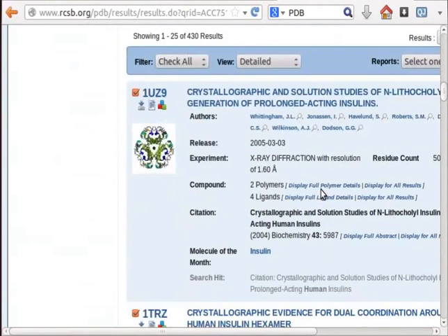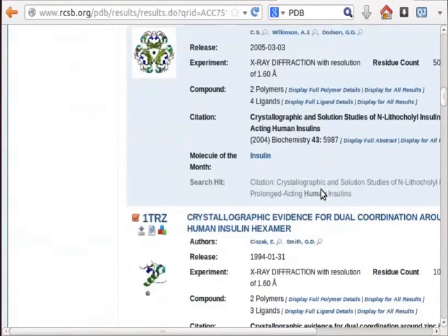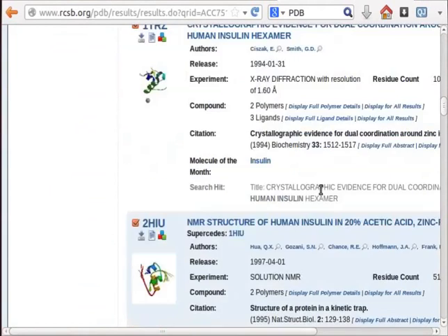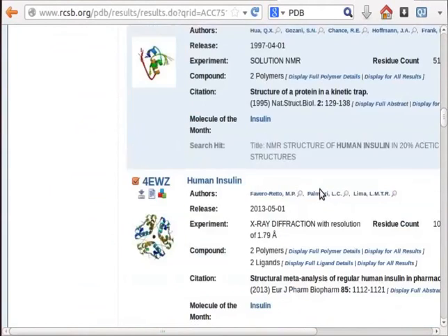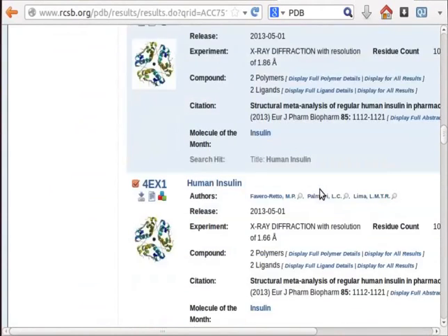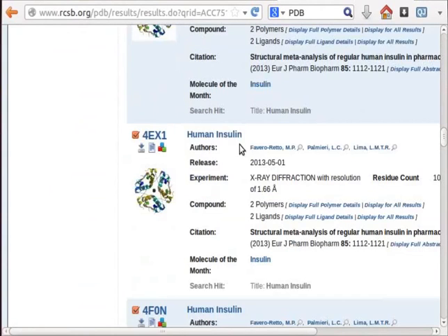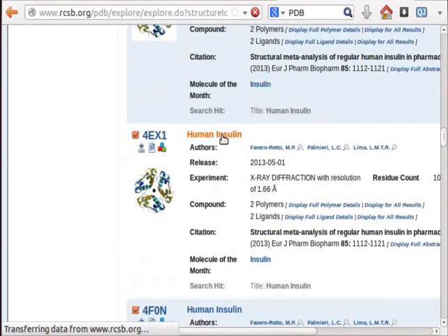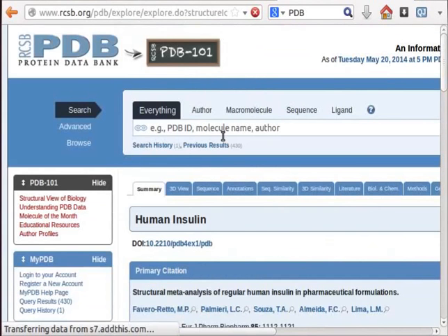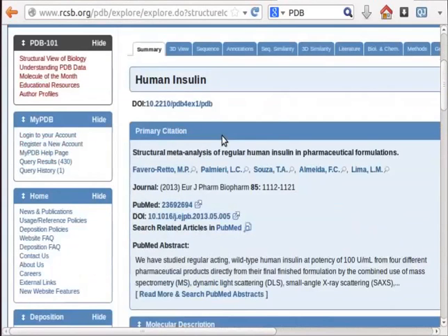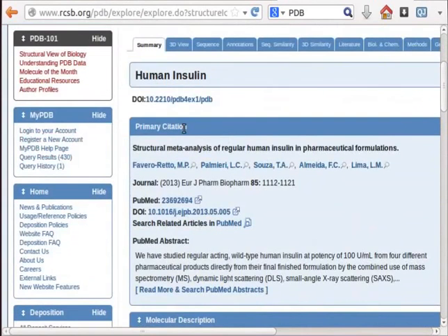A list of known structures of human insulin along with the pdb codes appear on screen. As an example, let us select human insulin with a code 4EX1. Click on the name of the protein. A window opens with all the details of the structure.